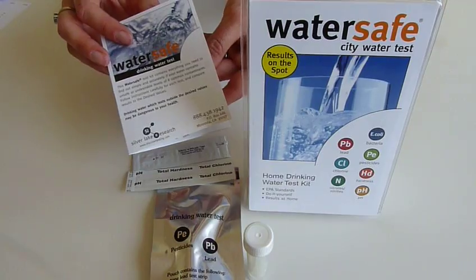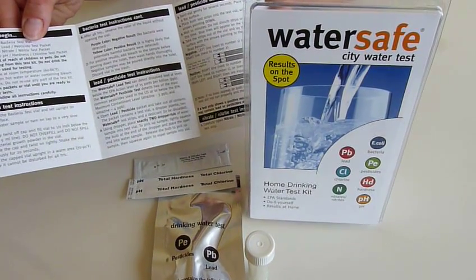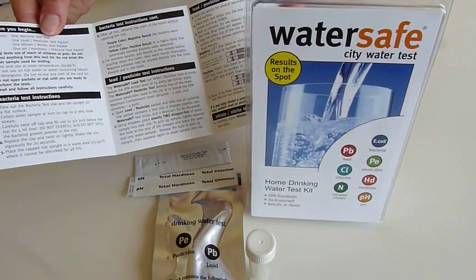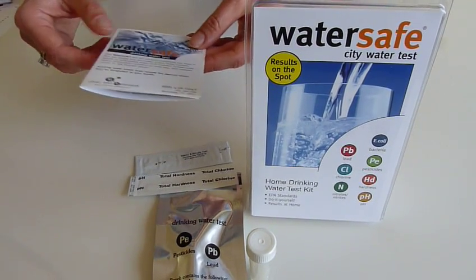All of this comes with very detailed instructions of how to use the City Water Test Kit. Now, it is important that you do test your drinking water regularly, especially when you just move into a rented property or you have moved into a new home.